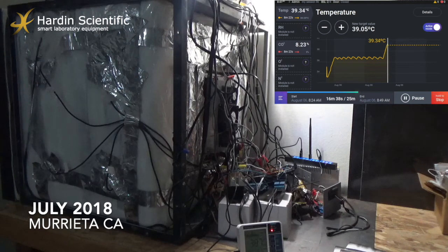So, as I said, right now we have to see less amplitude around the target than we had on the previous step, because the room temperature and the current temperature inside the chamber have a bigger difference. So let's just see how it will look.